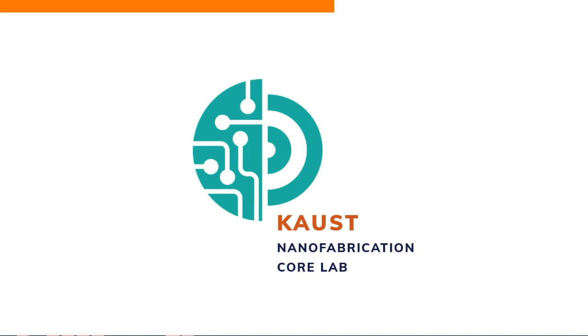Okay. Any other question about this high resolution? Hi, Eric. Let's say the highest resolution is 300 nanometers. Does it mean that we need to make both the minimum line width of the polygon 300 nanometers and also the minimum distance between the polygons 300 nanometers, right?